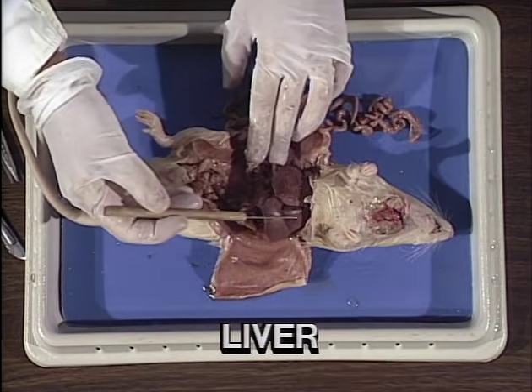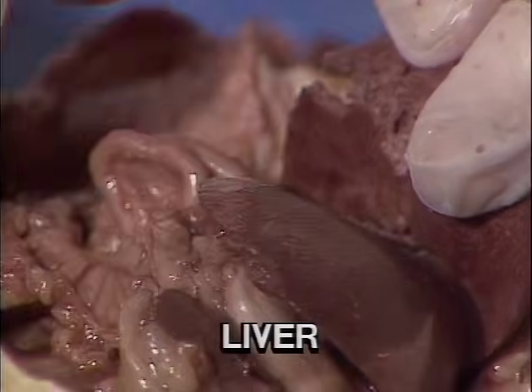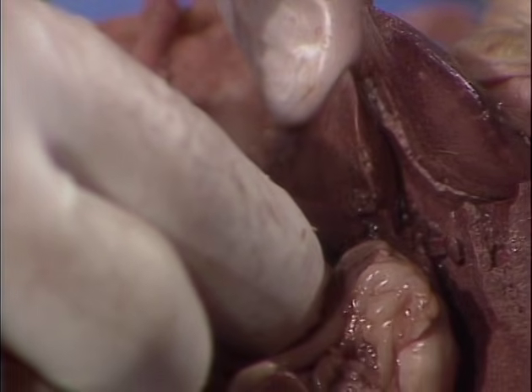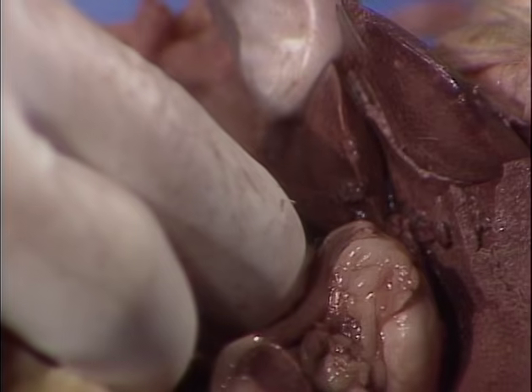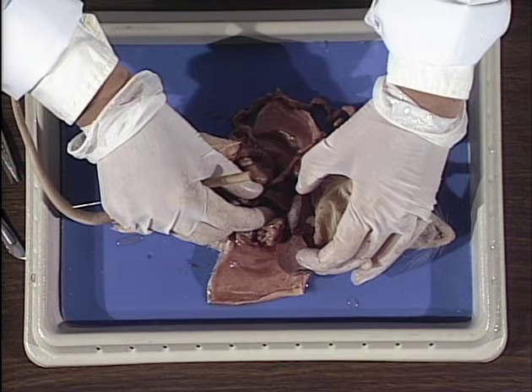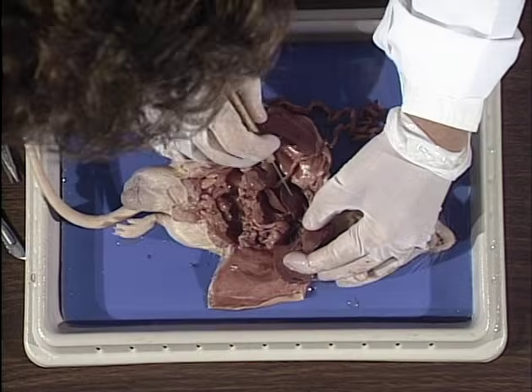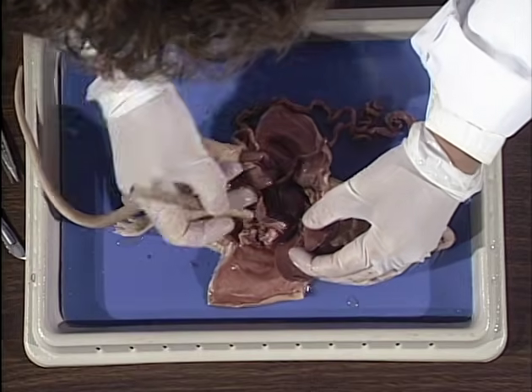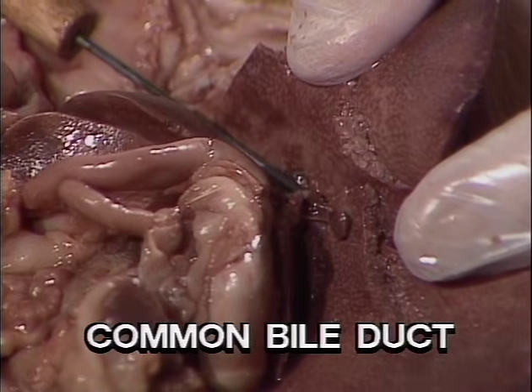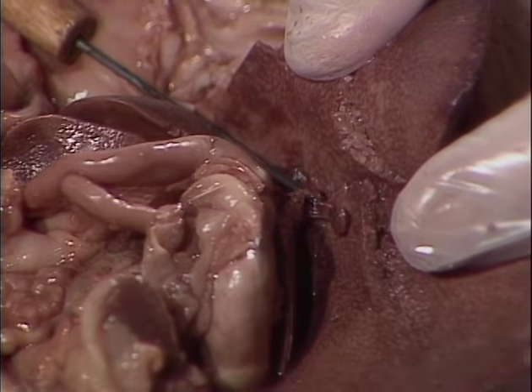The liver is quite a large structure, and technically it has 4 lobes. We see 1, 2, 3, and 4. The rat is unique in that it does not have a gallbladder to temporarily store the product of the liver, which is bile. Bile is a fat emulsifier. The bile will enter the first section of the small intestine, called the duodenum, through a duct called the common bile duct. The liver is also involved in storing glucose in the form of glycogen.